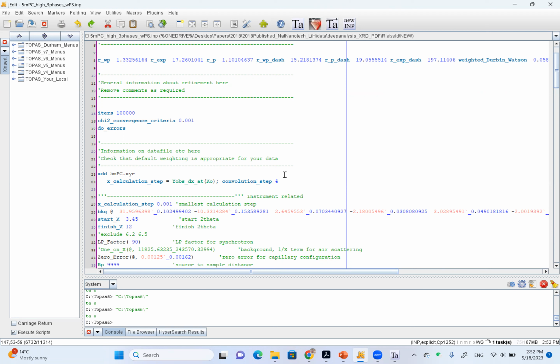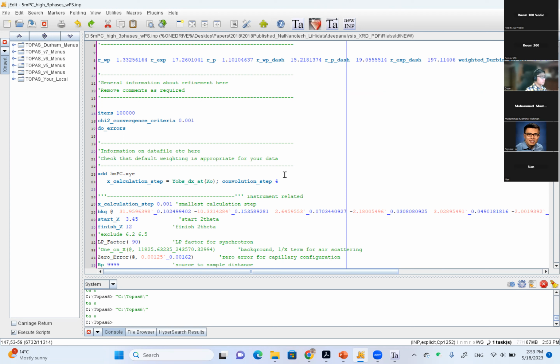The dV value for the area function, when you define it, you get a number. Does that directly correspond? I mean, can you get some idea about the crystallite size from that number? It's related, but it's not a strict definition. So for example, if you have a dV value like 4, right, for one phase, and another phase is 400, you definitely can tell that one has much sharper peaks, that's for sure. But if you say you have 4 for this phase, and you have 5 for another phase, you cannot really tell whether this one has a smaller crystal size than that one.